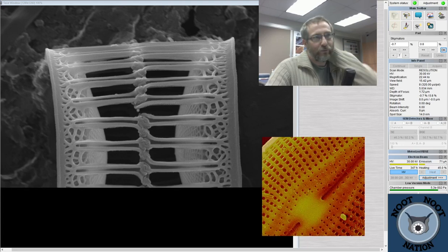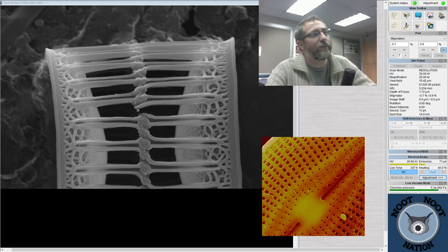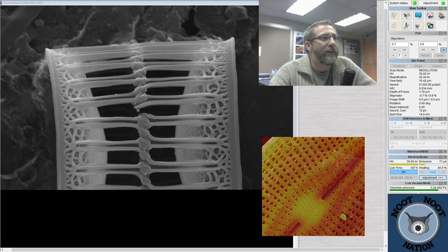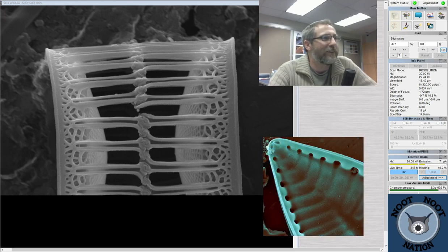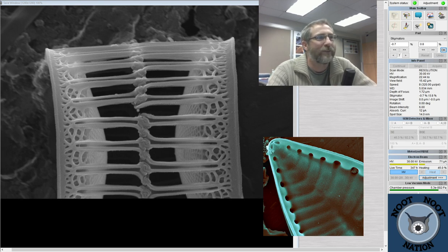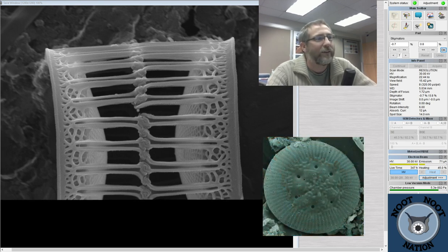We've seen some really beautiful diatoms from San Francisco Bay, and diatom metal, welcome in. We do sometimes put diatoms on our stream, pretty much all the time, actually. So the knuckles are showing very beautifully. Yeah, I think you can finally see them in this one. I got the focus nice and tight with the stigmation nice and tight as well.